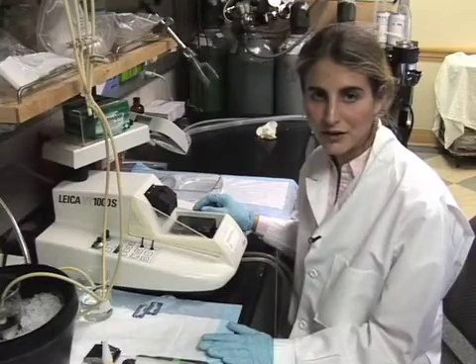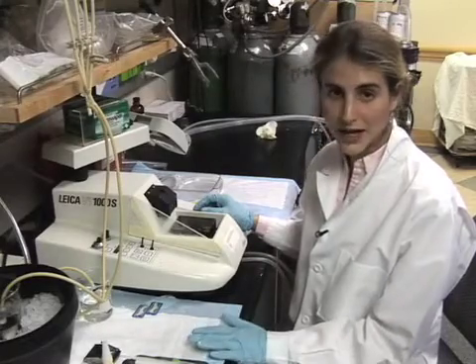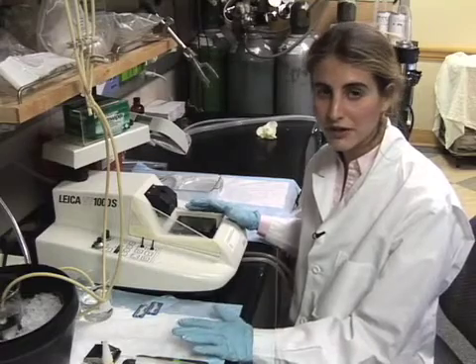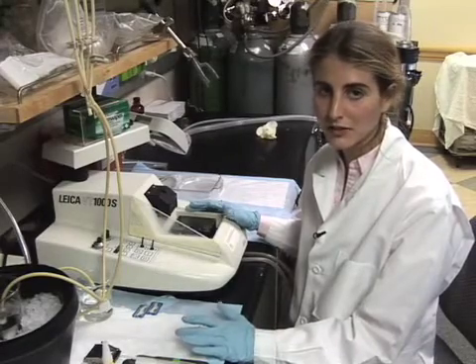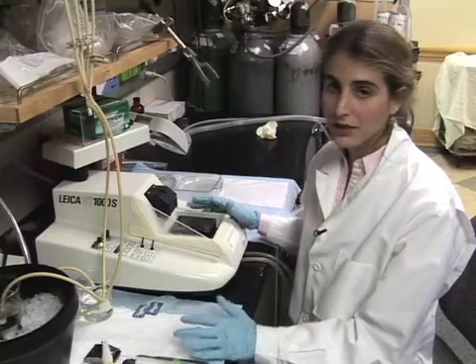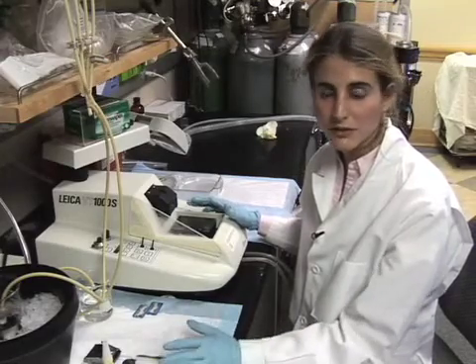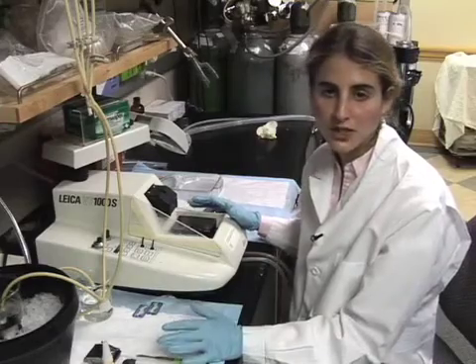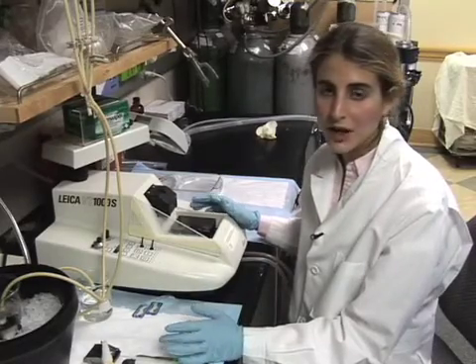Now we have our brains embedded in agarose and we're going to start sectioning them on the vibratome to make approximately 300-micron thick sections for slice culturing. We're going to do this in cold ACSF that is being bubbled with carbogen.